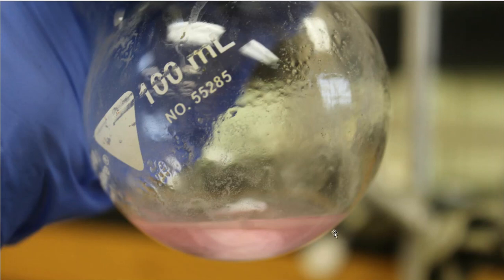All right, so I give this a good swish, and as I swish it, you can see that pink color forming even more, and then I dump it over into the separatory funnel.